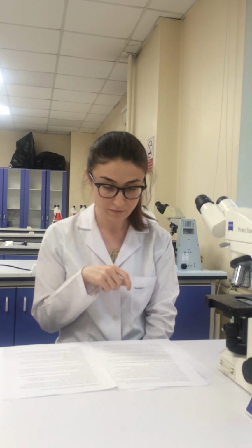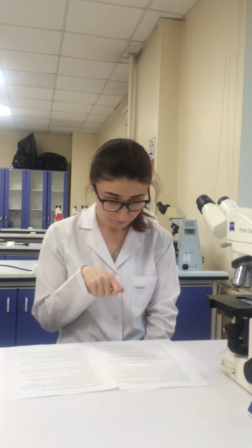Generally, these stem cells are seeded on 6-well tissue culture plates for adipocyte or osteocyte differentiation, and the plates or dishes are incubated in a 37 degree Celsius incubator in air with 5% carbon dioxide to allow cell attachment to the plates.